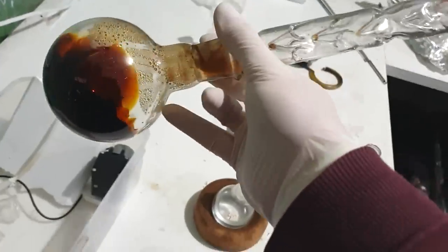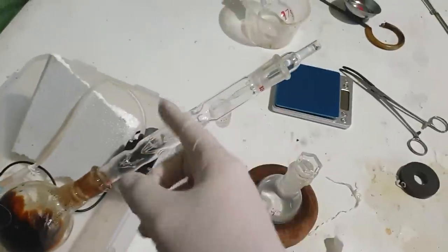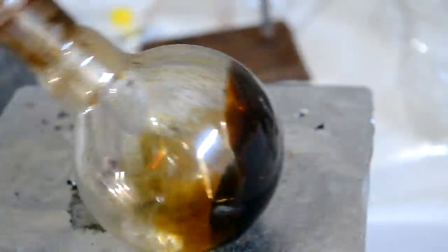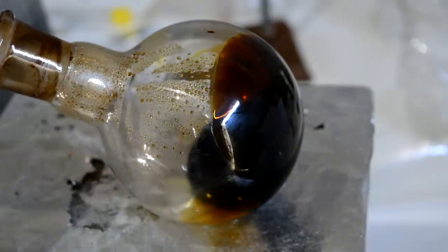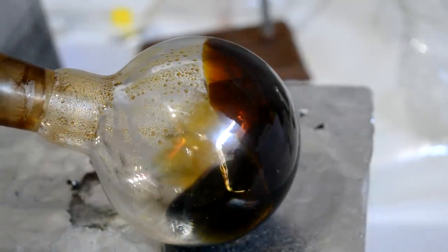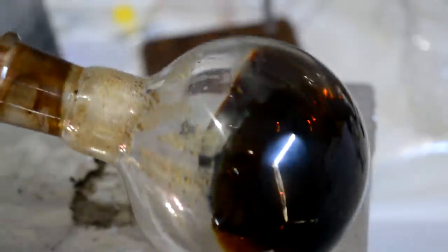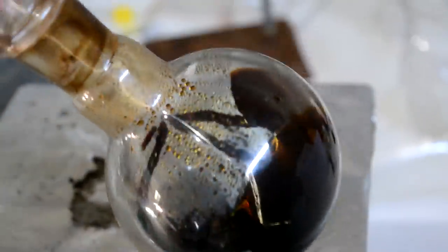So I'm not going to start hating on red, but it was a mistake we should have seen coming. And I might have got away with it as well if I hadn't used such a huge amount of sulfuric acid. I think I used 4 to 5 mils. And honestly, it's about 10 times as much as I should have used. Way overdone. And that really contributed to this aldol condensation side reaction. So the ethylene glycol gets washed out during the washing steps, and cyclopentanone ends up as tar.